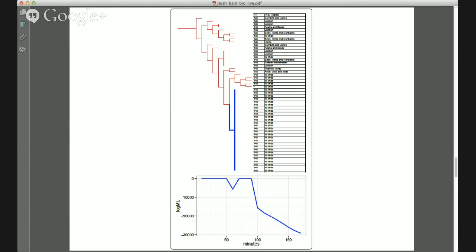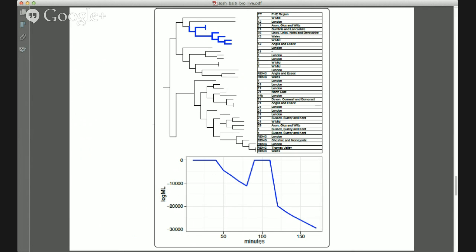So we were very grateful to have the chance to integrate our data set with the ongoing surveillance sequencing from Colindale, and we were working with those guys. And what we found was that this is the outbreak strain, and this is the probability of it being placed into the outbreak cluster. You can see that after 100 minutes, we've got a high probability of it being within that outbreak cluster. And the other non-outbreak strain, you can see it placing elsewhere onto this reference tree. And we've got after 120 minutes, strong probability that it's placed there.